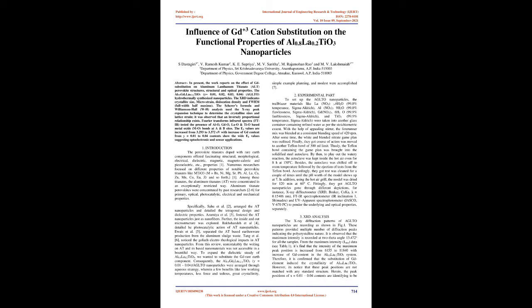Fourier transform infrared spectra, FTIR, tested the presence of Al-O, Gd-O, La-O, and Ti-O based metal oxide, MO, bonds at A and B sites. The Eg values increased from 3.293 to 3.372 eV with increase of Gd content from y equals 0.01 to 0.04. The wide Eg values suggest optoelectronic and sensor applications.